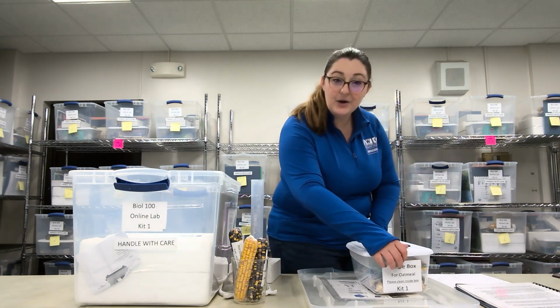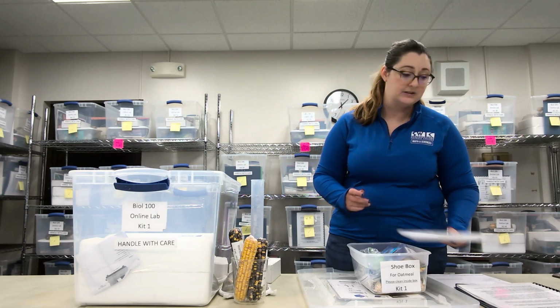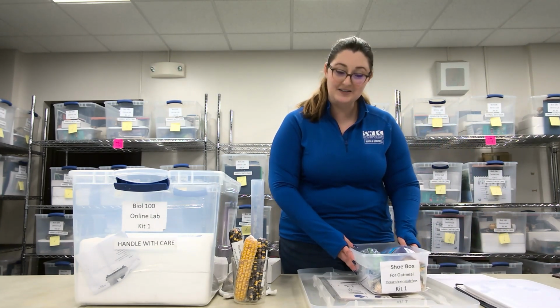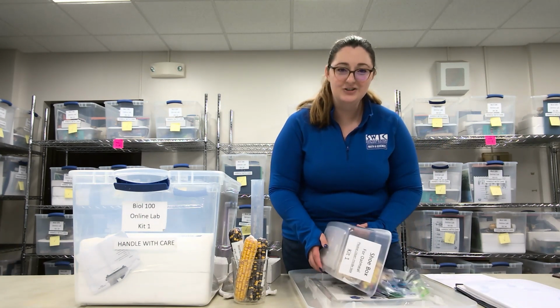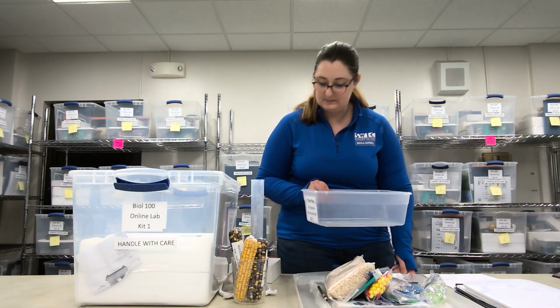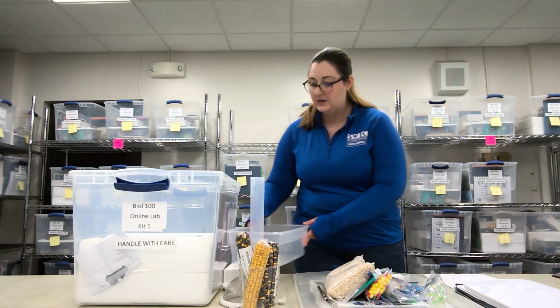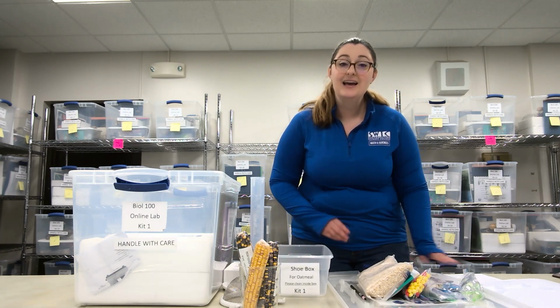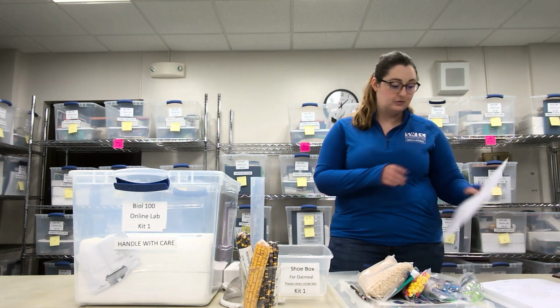Now, I kind of go in a little bit of a weird order, so bear with me. First thing we're going to do is take off the lid to that little shoe box, and we are going to dump the contents carefully, gently, onto that box lid. We are going to put the items back into the box in kind of a backwards order, and it makes a little bit more sense once we go through it.